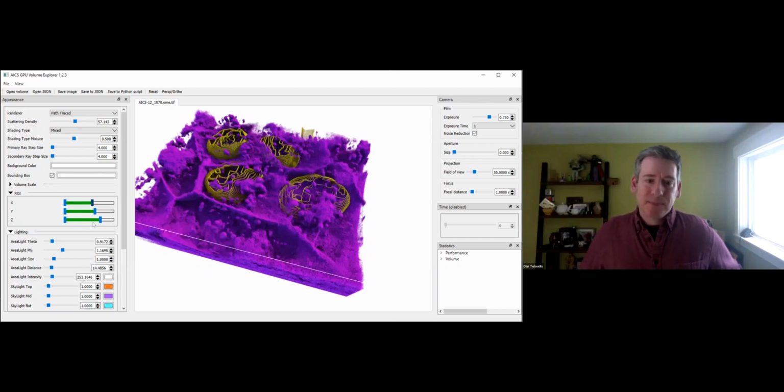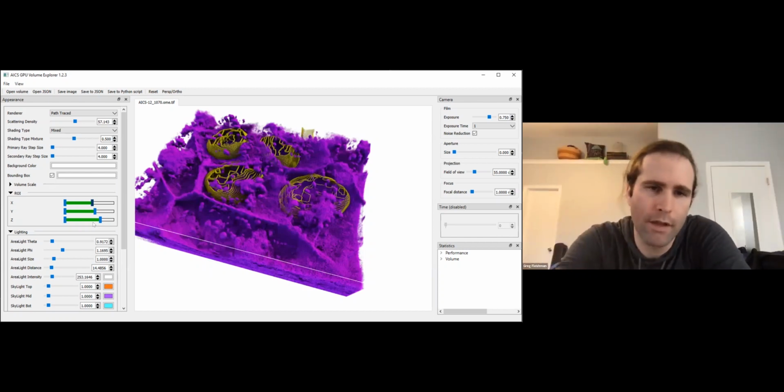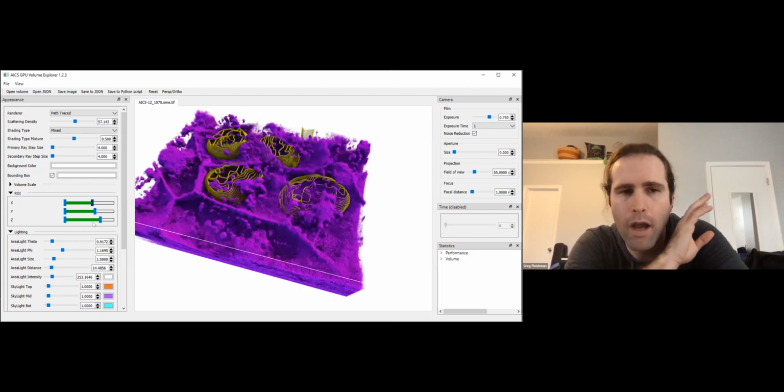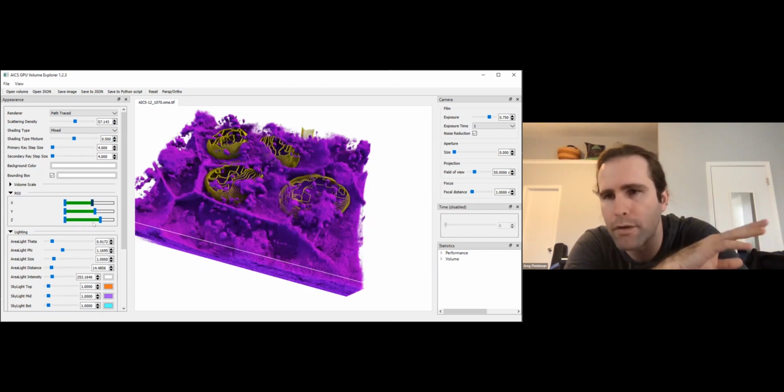Great. And then one of my full questions, and I think Ulrike also mentioned this in the chat. I have some data sets that I would love to look at that are combinations of intensity data, like a proper microscope image, and a 3D point cloud, detections of 3D locations within that volume. If I understand correctly, there's no geometry in here yet. Your annotated data are binary images that have been added to the TIFF as a separate channel, right?